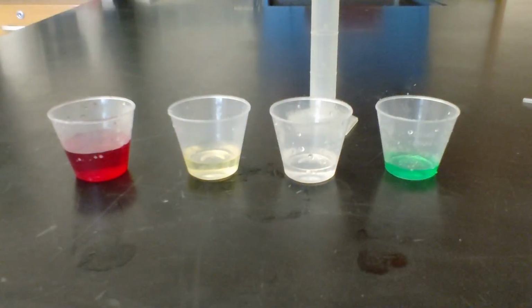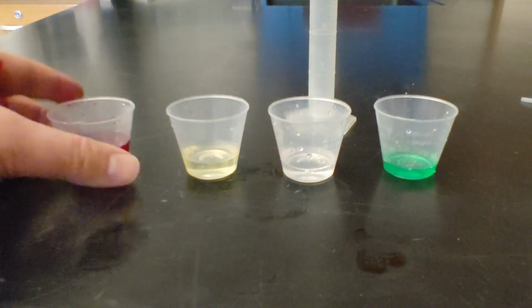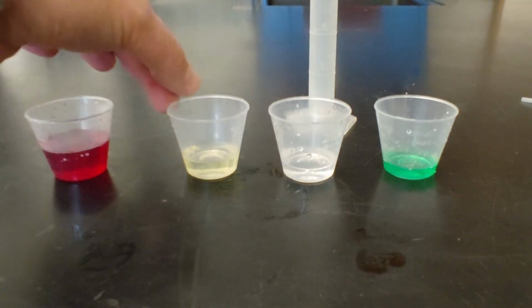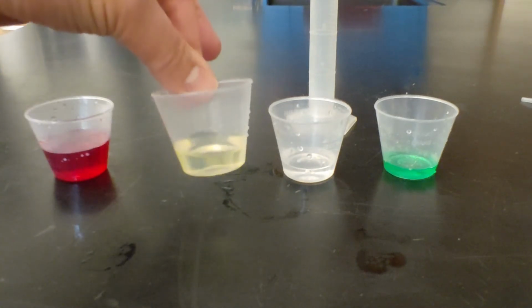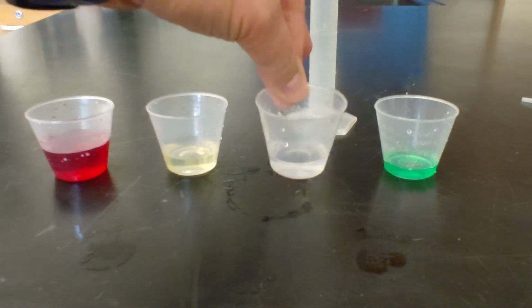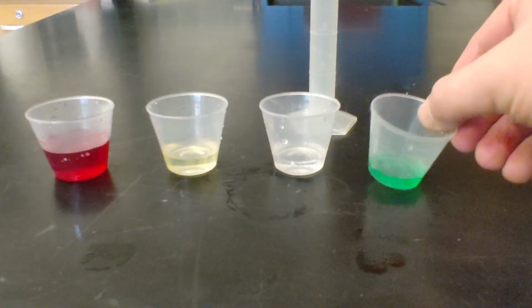And so the first thing I want you to do is, knowing what they look like now, I would like you to pause the video and make a prediction. Which of these do you think is the most dense? Which one do you think is the least dense?